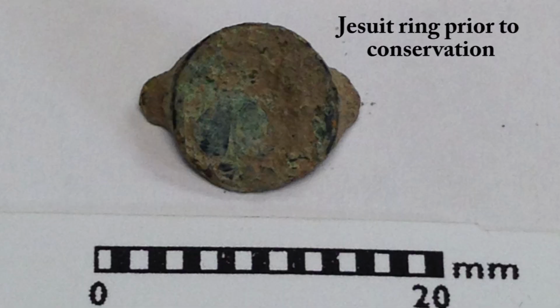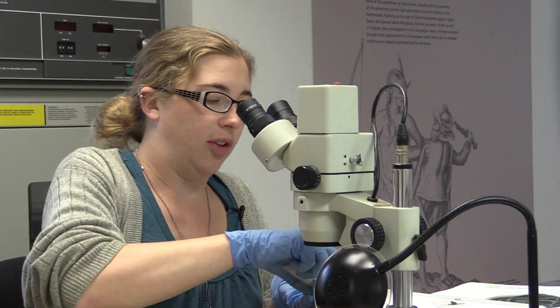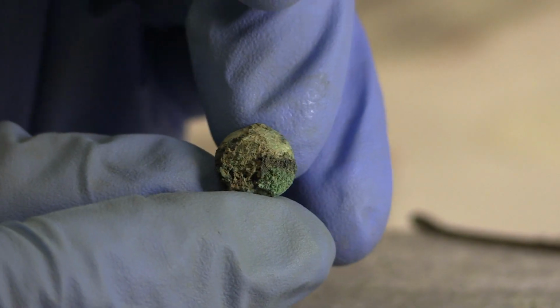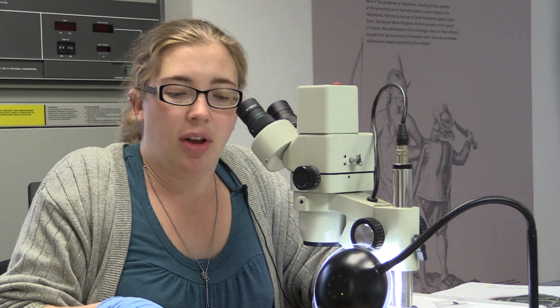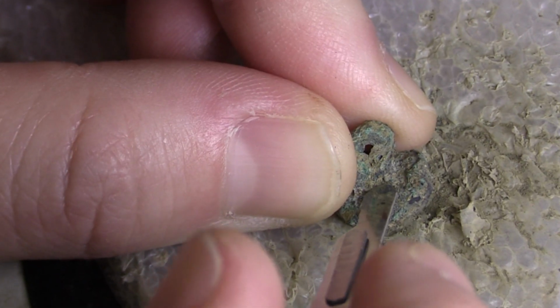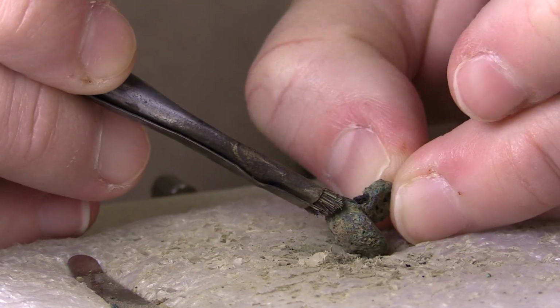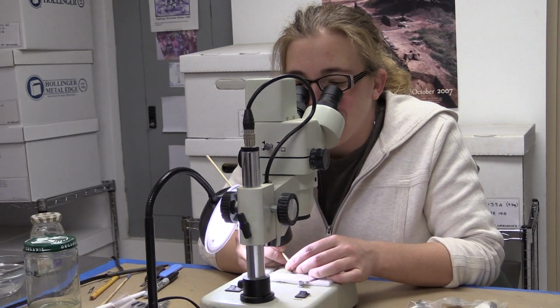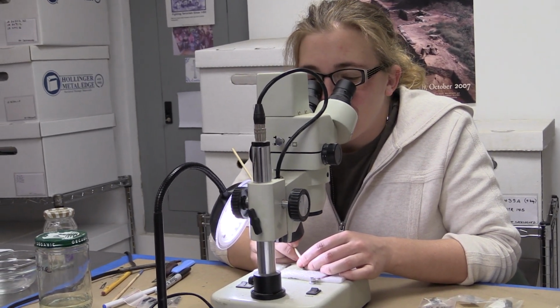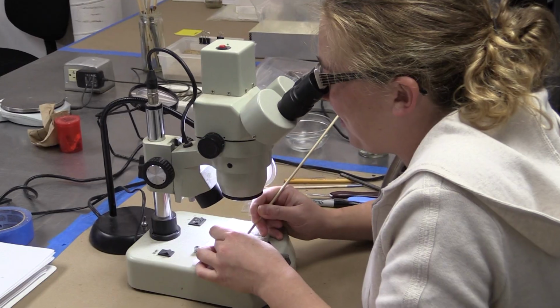What I do with most copper and copper alloy artifacts in order to conserve them is I start out underneath the microscope. So, for example, I'll show you with a few buttons that haven't been cleaned yet. I start with something that's covered in corrosion, barely recognizable as an object sometimes, and I work on it underneath the microscope, generally scraping with scalpels and with wooden tools, and also using brushes to get all the corrosion off. We leave the very last layer of corrosion, which usually is a protective layer, rather than going right down to the bare metal, which causes more corrosion to occur as the object is exposed to the environment.